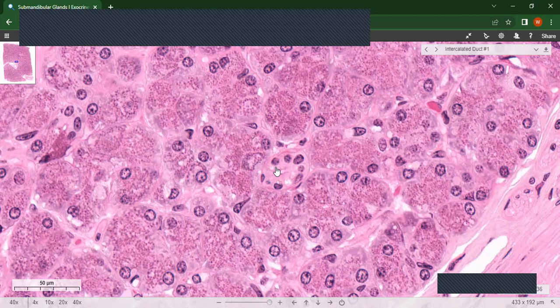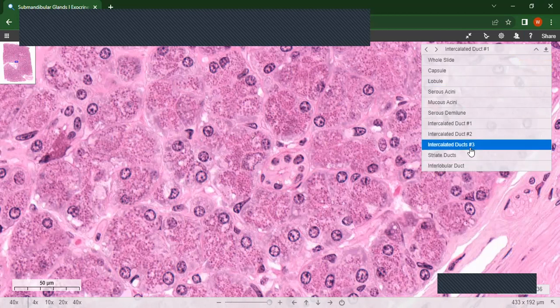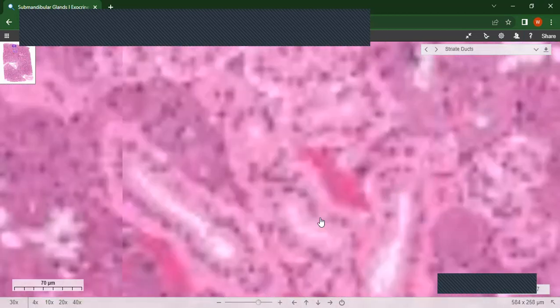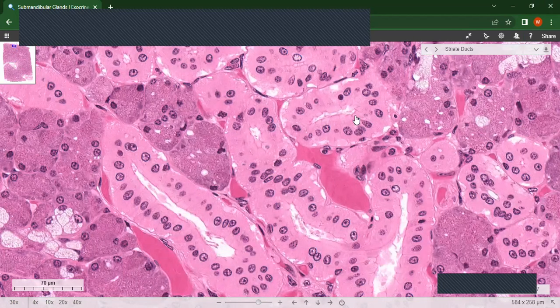Several intercalated ducts drain into a striated duct. This is an example of a striated duct. You can see it is somewhat larger than the intercalated duct. The cells are columnar — you can see the nucleus is round and spherical. They are also surrounded by some capillaries.